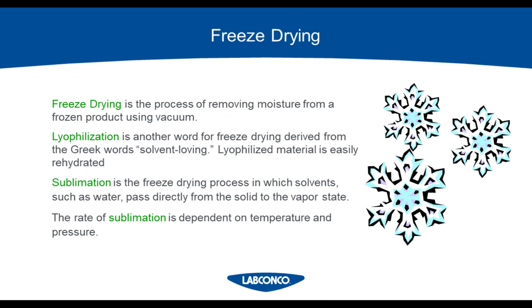First, we'll start by discussing some common terms you'll hear when talking about freeze-drying. Freeze-drying is the process of removing moisture from a frozen product using a vacuum. But another term you might hear is lyophilization, which is another word for freeze-drying that is derived from the Greek word solvent-loving. Lyophilized samples are easily rehydrated, making it a great process for sample preparation because you can easily resuspend your samples.